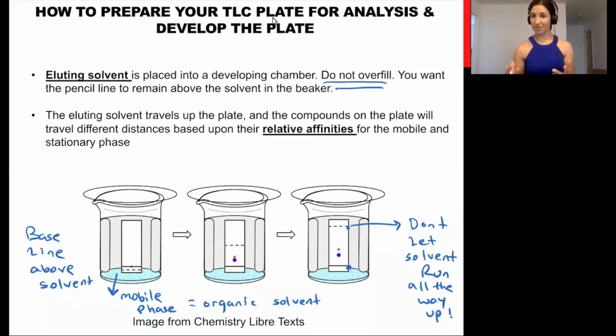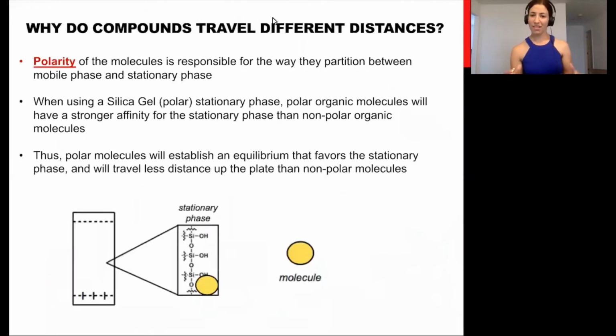And this is the physical separation we're looking for among different molecules. Why this happens is because in chromatography, each individual molecule will have a different relative affinity for the stationary versus the mobile phase, okay? So what we're going to spend some time taking a look at is where this different affinity arises from. Okay. One of the important concepts in this discussion is going to be polarity.